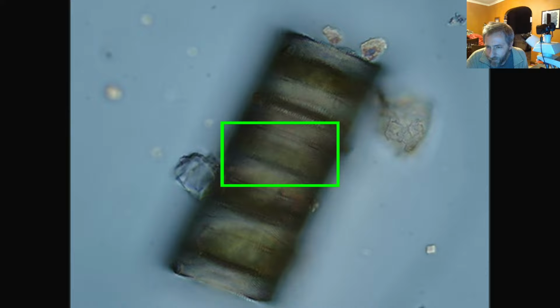Are they attached solely via a Velcro-like structure, or do they secrete an adhesive? There's some organic component that's also helping to hold them together. But for this particular group, Ulnaria, they have what are called cameo and intaglio type structures, which is really like Velcro, where they interlink, like one side is grooved and the other side has gaps, and they fit together like a puzzle piece. It's really hard to separate them, which is why we often find them in these long, cigarette-stick-shaped colonies, right? Where they're together. So there's a physical connection, but they also usually secrete a little mucus between them to help hold them together. So, yeah, that's the general concept for them.